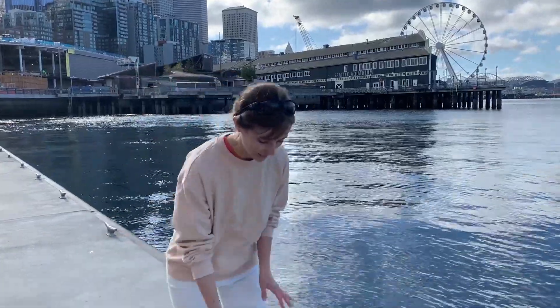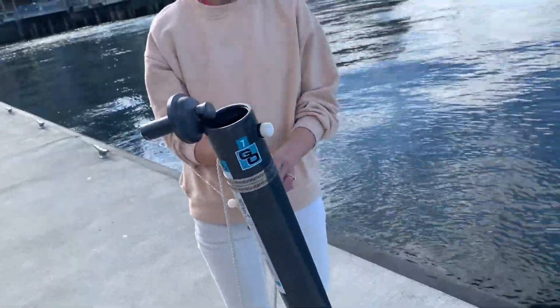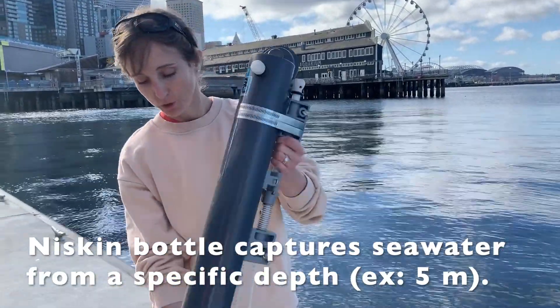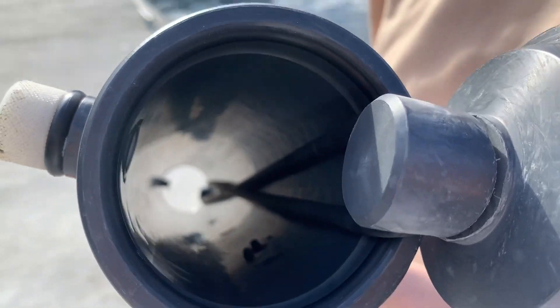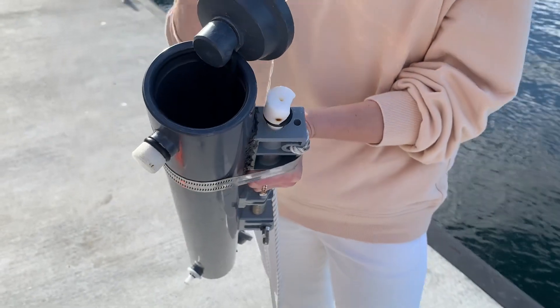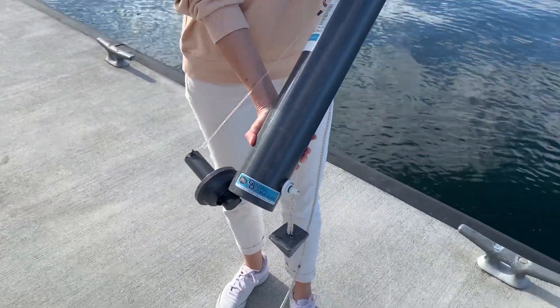I'm going to start with the Niskin bottle. The Niskin bottle's purpose is to capture a sample of water from a specific depth. If you look at the bottle you can see that the main bottle itself is just a hollow tube — just a piece of plastic — but inside you can see latex tubing which connects two stoppers, one at one end and one at the other end.